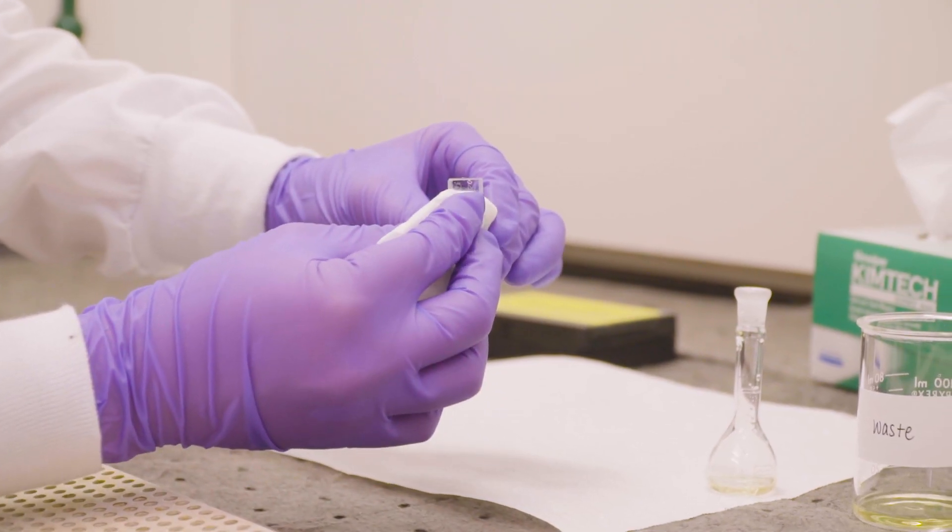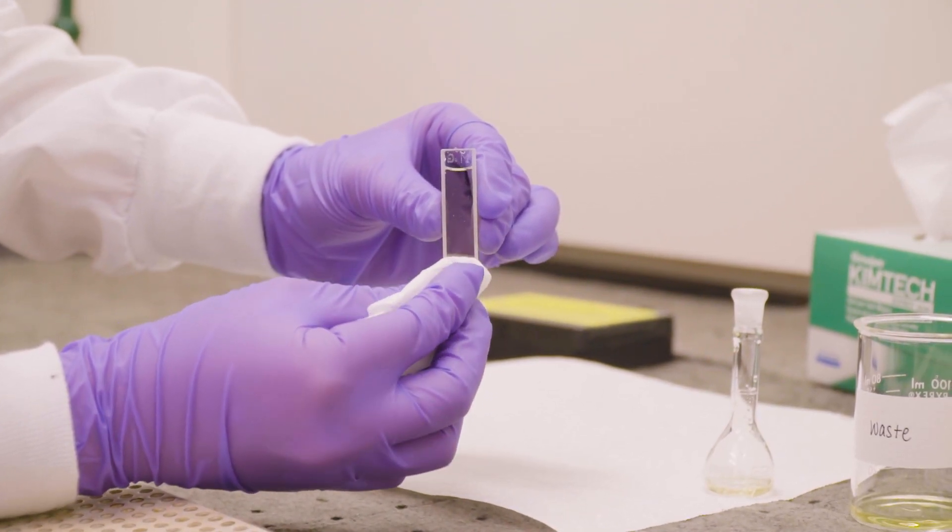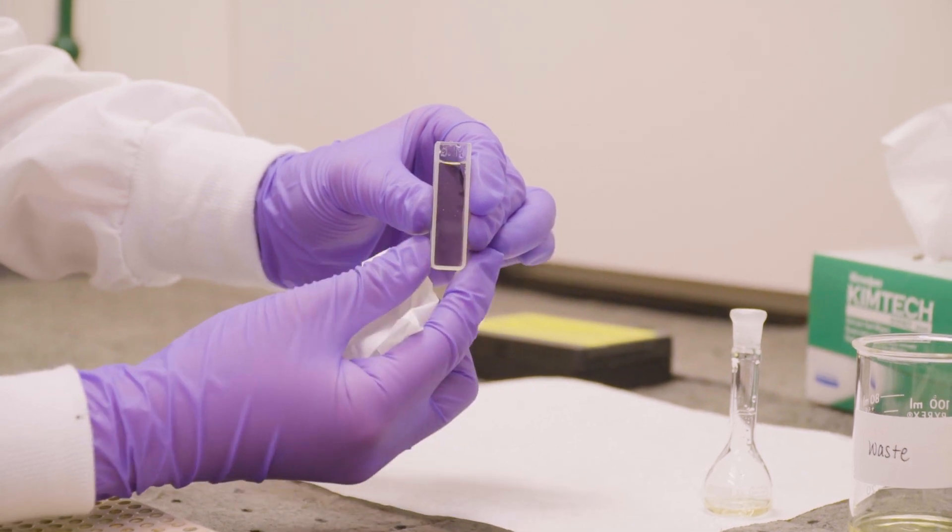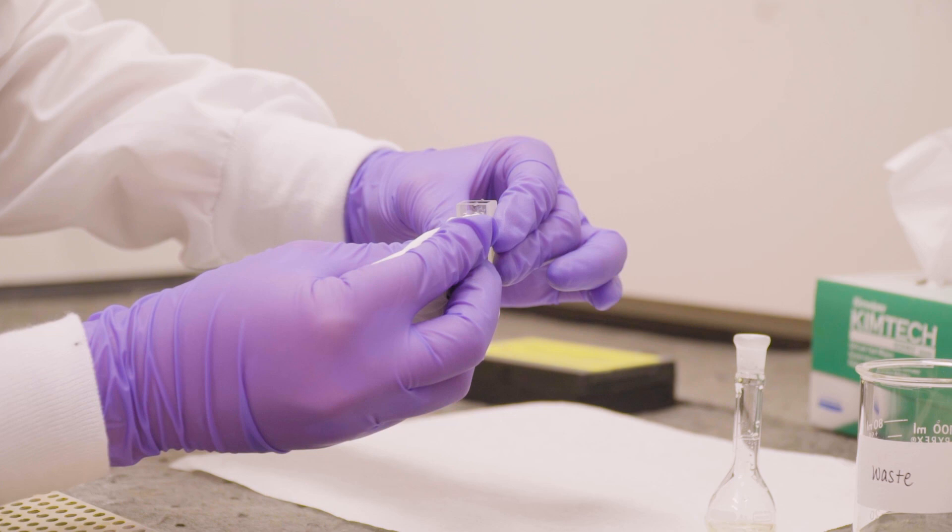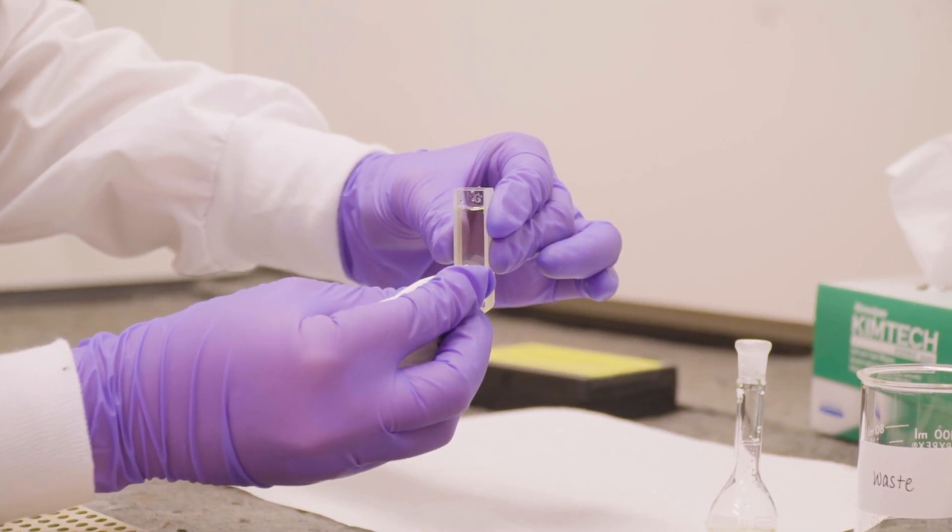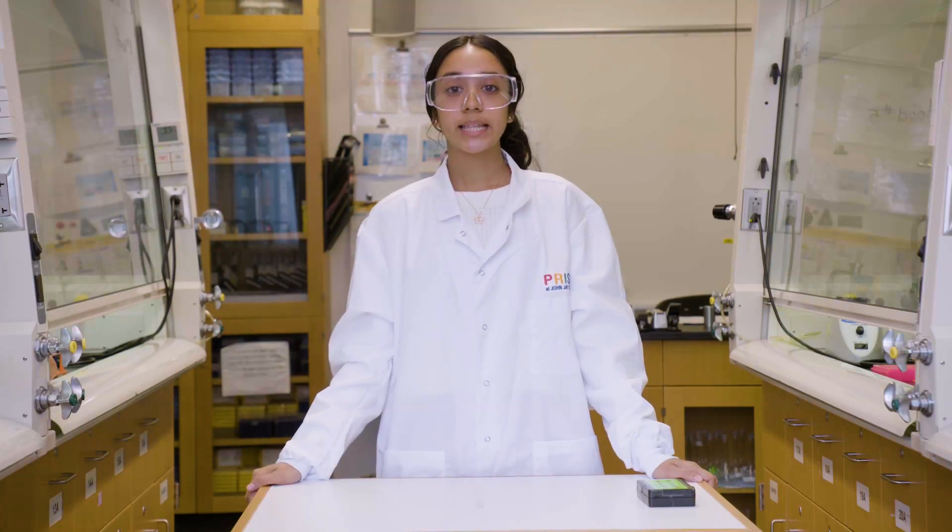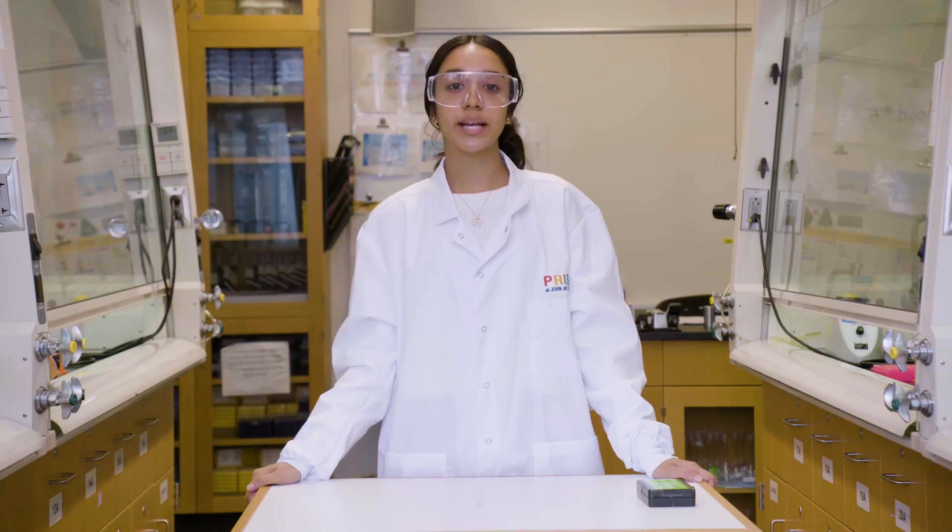If you do notice any fingerprints or droplets on the clear sides, gently clean them with a Kim wipe. Avoid using paper towels or any material that may scratch the surface. Now that the cuvette is clean, let's move on to proper usage during analysis.